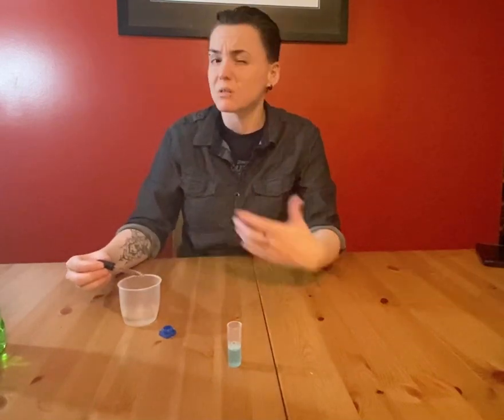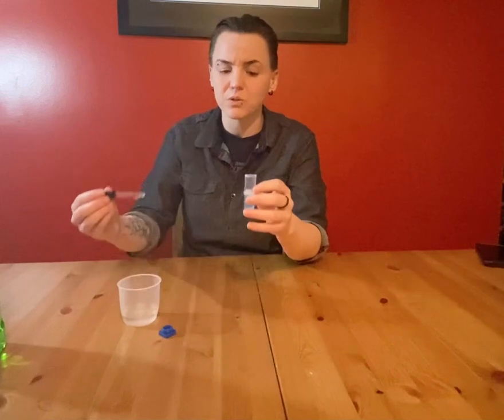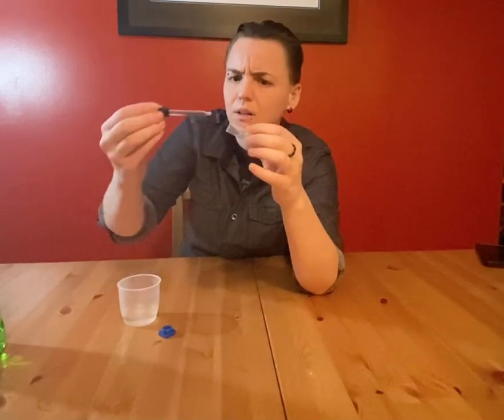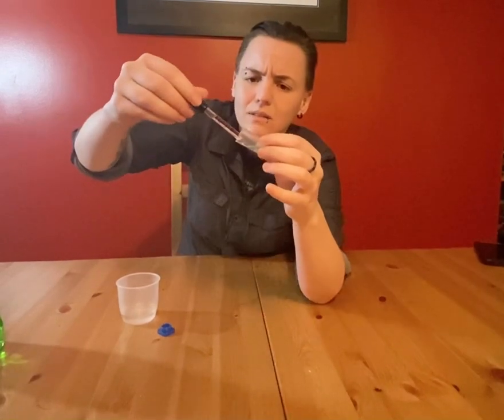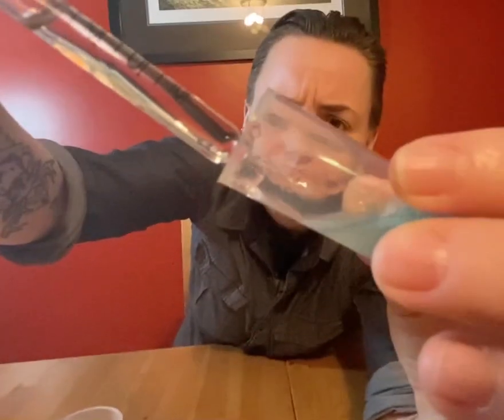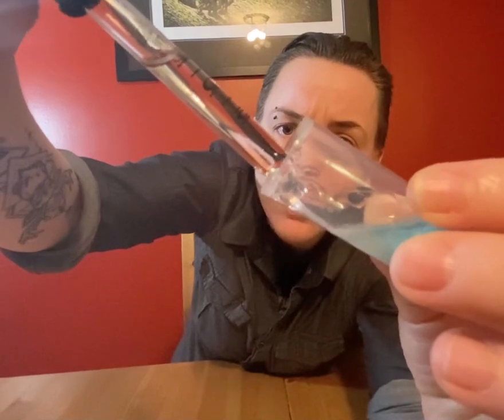This experiment works better if you cool the alcohol before you use it. You tip your test tube at a 45-degree angle, and then you take your dropper and just lay it into the side here. Then you very slowly release the alcohol so that it floats on top.